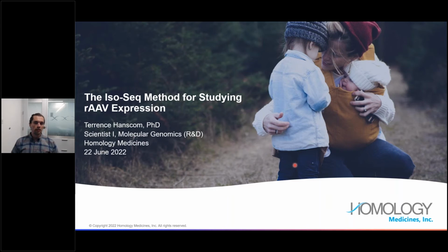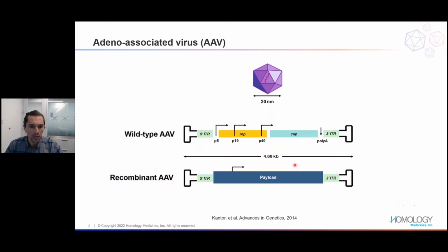I'm a scientist here in R&D at Homology Medicines, and I'm very excited today to tell you a little bit about some of the work that I've been doing with targeted mRNA isoform sequencing using PacBio so that we are able to characterize our recombinant AAV therapies. So I was thinking at first it would be really nice to go into some of the background biology.